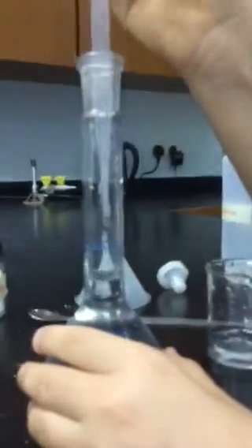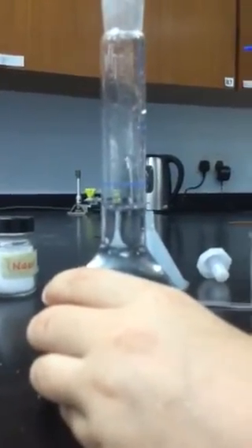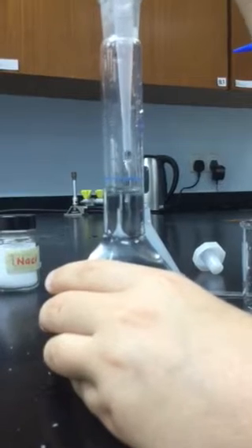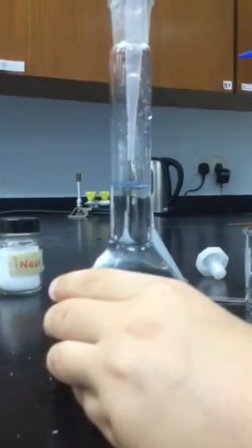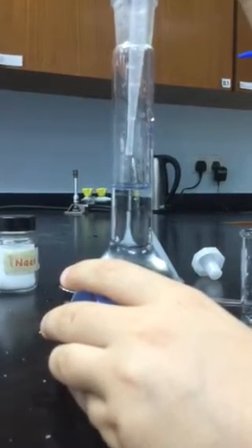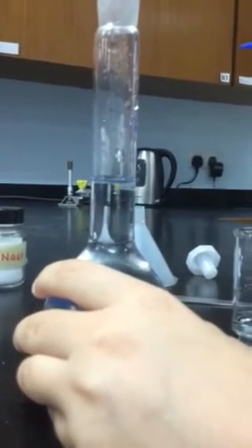Okay, I'm going to come round. Okay, so slowly now, drop by drop, until that bottom of our meniscus, slowly now, maybe two more drops. I can see. You mustn't touch the liquid with your teat pipette. One more drop, Nina. One more drop is going to do it, I think.